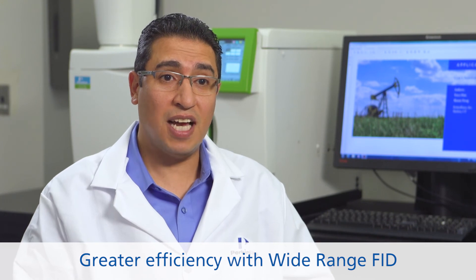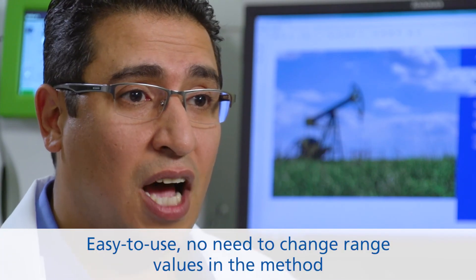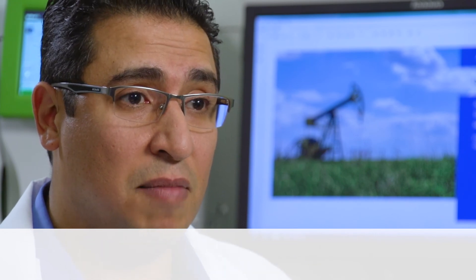Besides the other benefits and features of the wide-range flame ionization detector, you can measure low and high concentrations in a single run without changing any settings in the method.